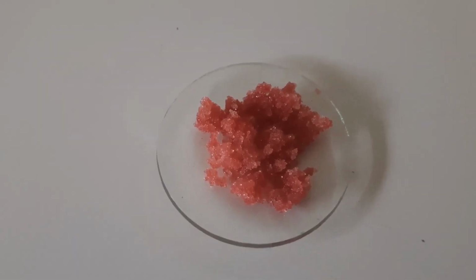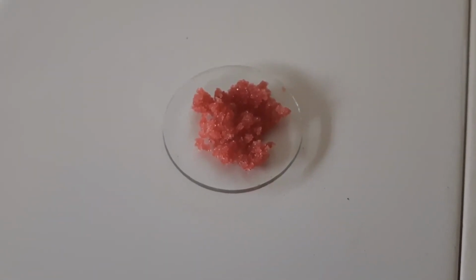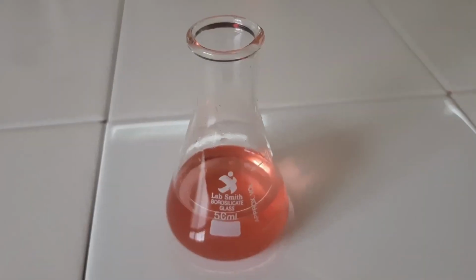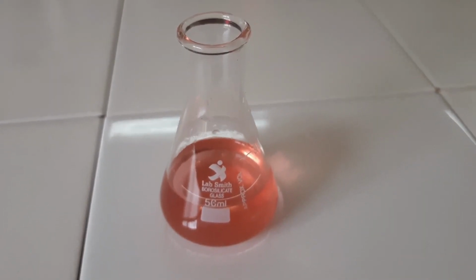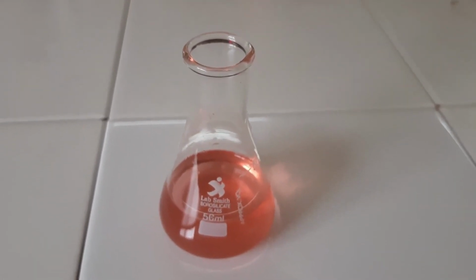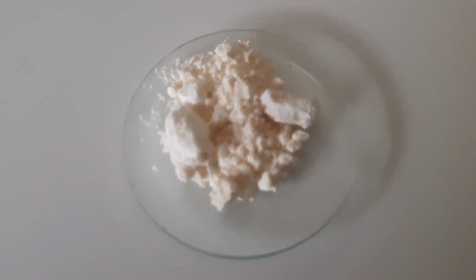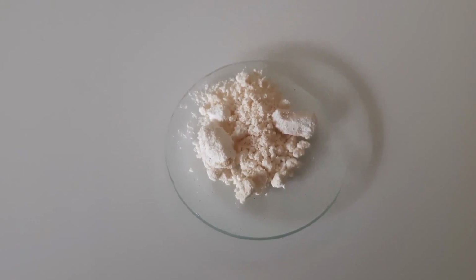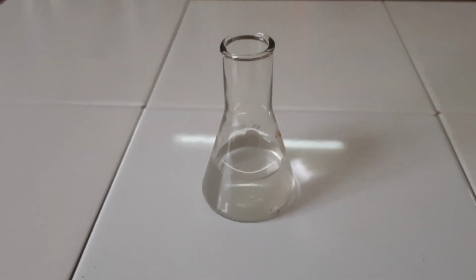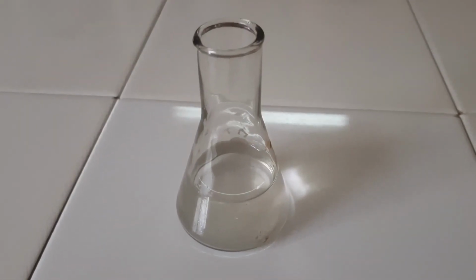This is solid cobalt chloride. After dissolving this solid, you can make a pink color solution. This pink color solution contains cobalt 2+ ions. Now you can see a white color solid. It is zinc sulfate. After dissolving zinc sulfate, you can make a colorless solution. This solution contains Zn2+ ions.